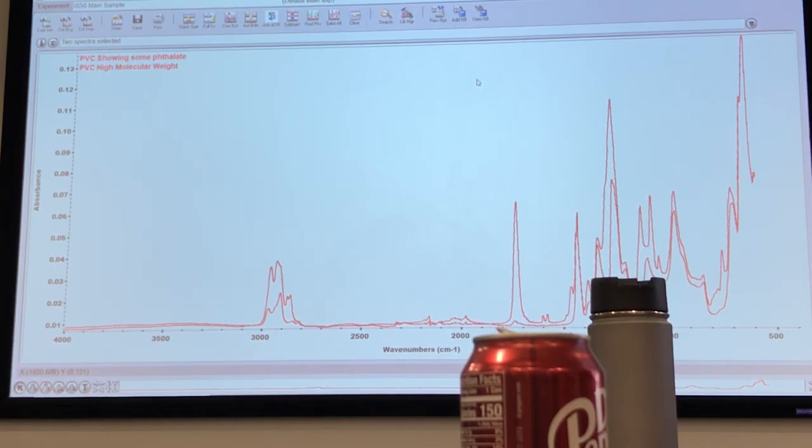Water. If people are running these production facilities, right? Think a little bit harder. What's the most common? Actually, skin or hair. Yes, skin or hair. All right. Actually, for a lot of clean room samples that we analyze, mostly for the semiconductor fab people, the most common contaminant is skin cells. Skin particles, skin cells. You'll see it over and over again.